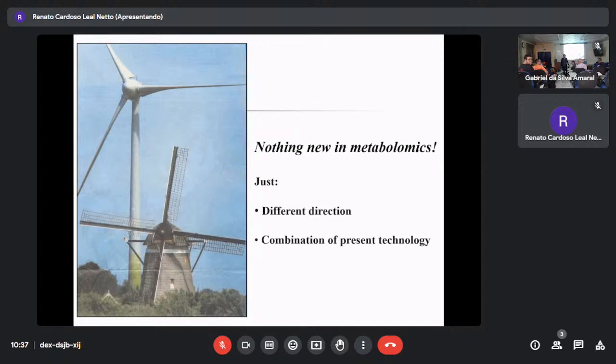Second question: can plant extracts be used in metabolomic analysis? If so, how many milligrams? Can plant extract be used in metabolomics? Yeah, this is okay. Instead of plant material, I want to do metabolomics of an extract.